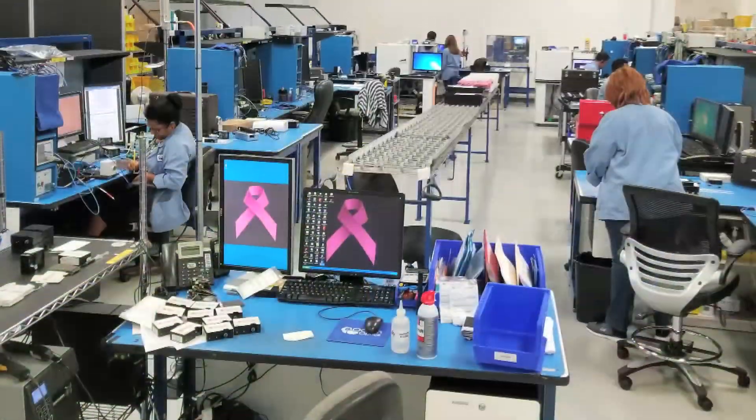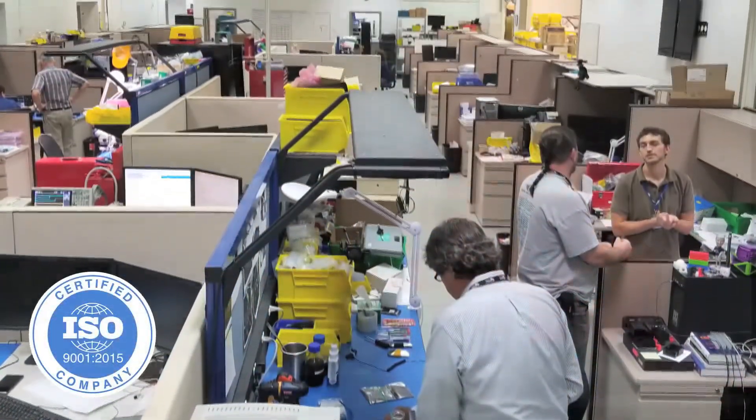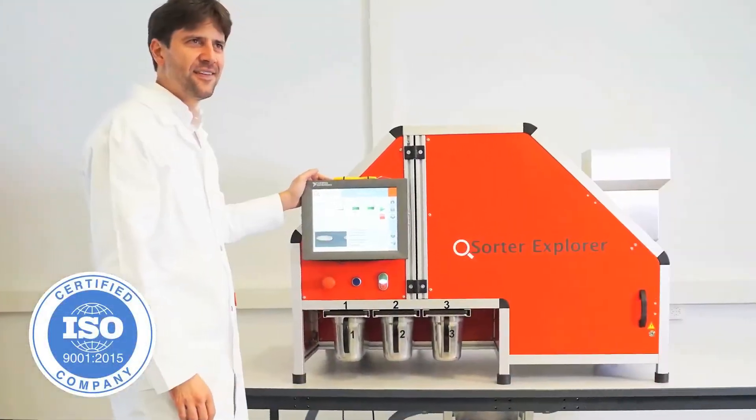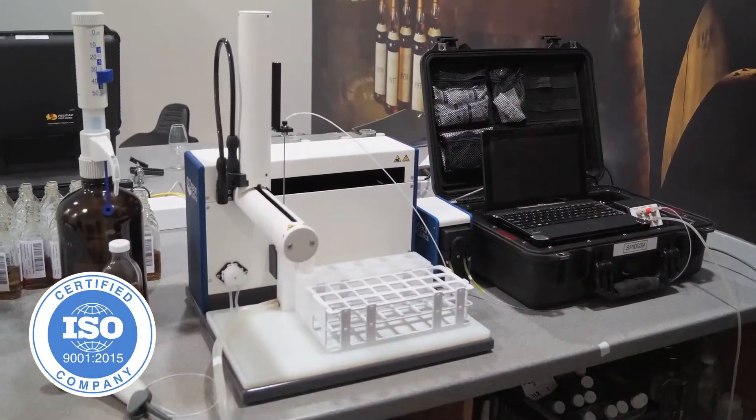In fact, we have a dedicated team of engineers who can work with you to integrate our products into your system design, smoothing the path from proof of concept to volume production.